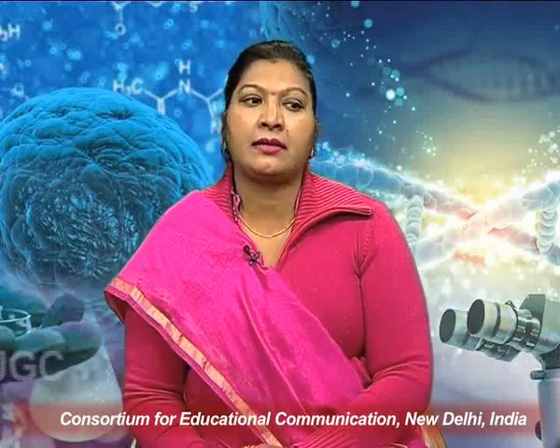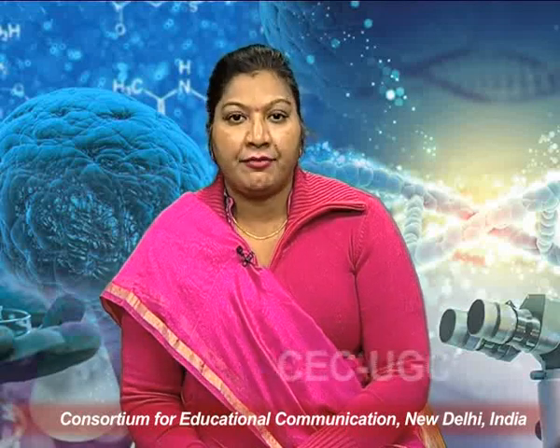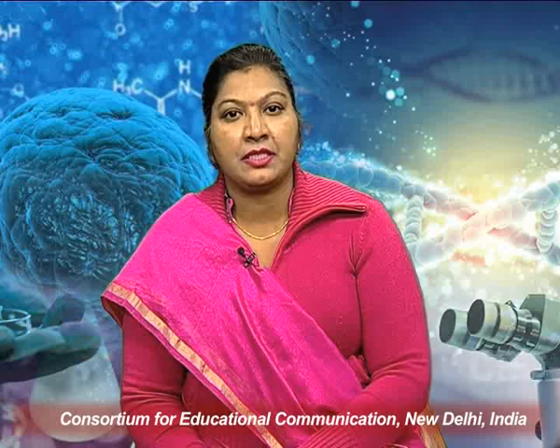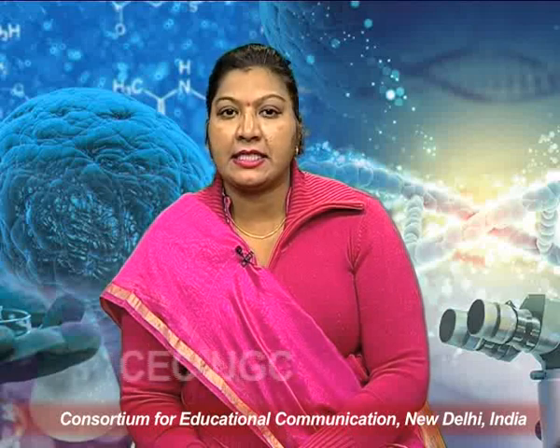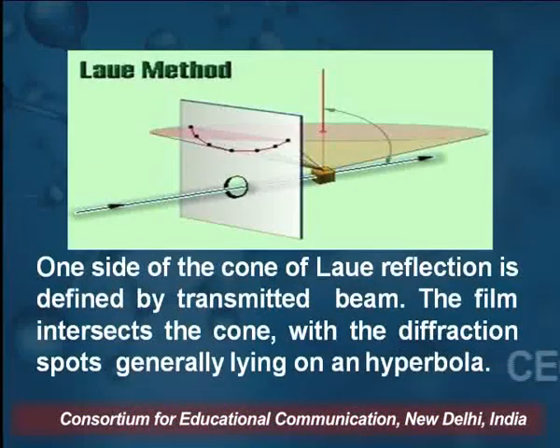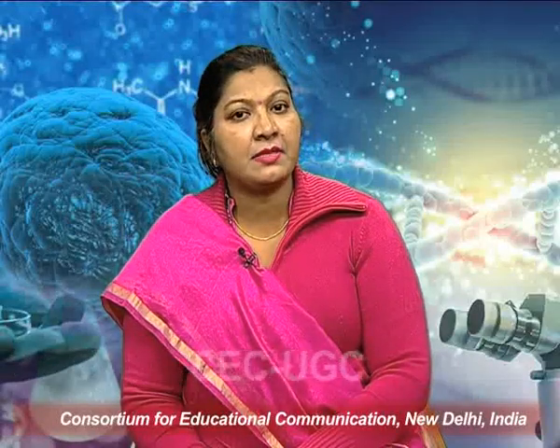Here we see in the diagram the Laue method, where one side of the cone of the Laue reflection is defined by the transmitted beam. The beam is transmitted from the crystal. The film intersects the cone with the diffraction spots generally lying on a hyperbola. We can get the output in the form of this hyperbola. So this is the back reflection Laue method. Next is the transmission Laue method. As the name suggests, light will be transmitted.